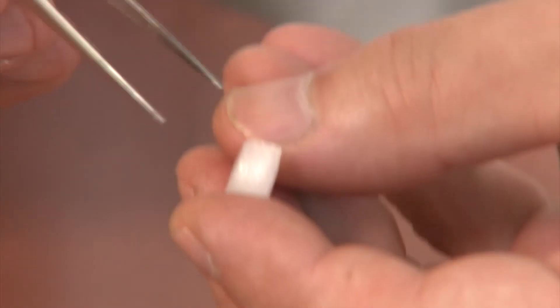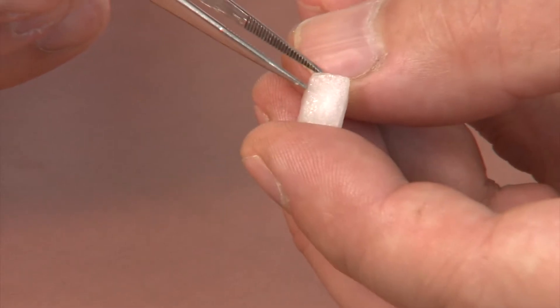Using fine forceps, carefully peel the clear layer of tissue from the inner, concave surface of a piece of onion.